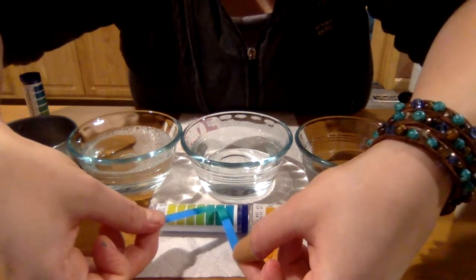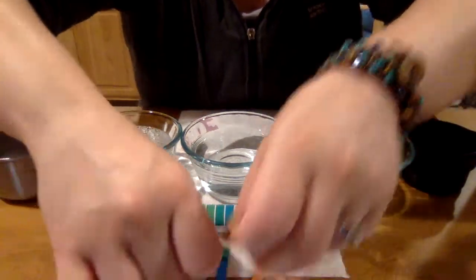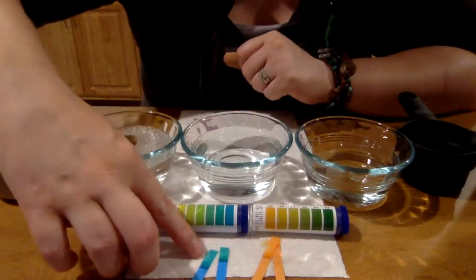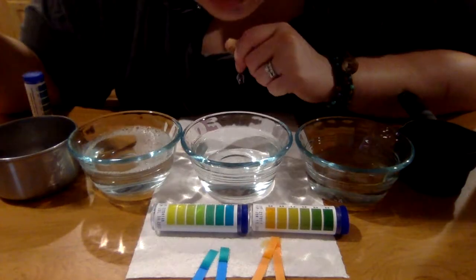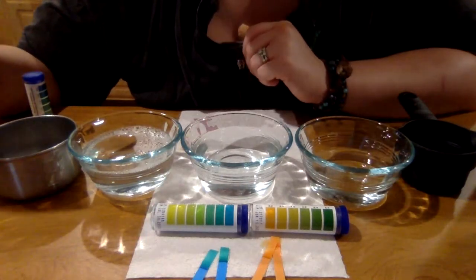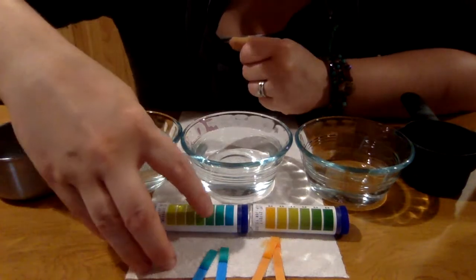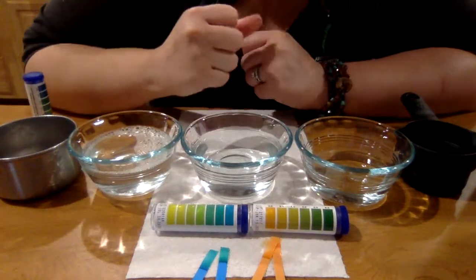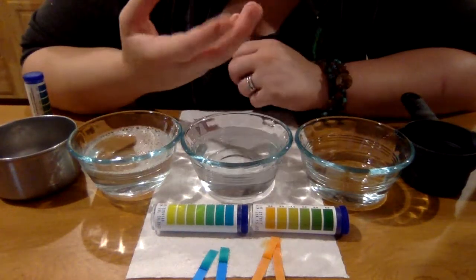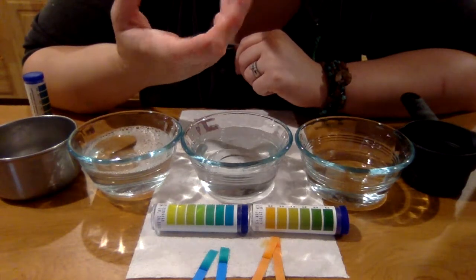So whichever they are, let's say about 2.5. They both have a pH somewhere around 2.5. Now, the slightly different hues are not enough to really match the 3 or the 2, but we can tell that they're going to be around the 2.5, give or take. Now, is it going to be exactly? No, one might be 2.2, one might be 2.3, but they're going to be closely around there.